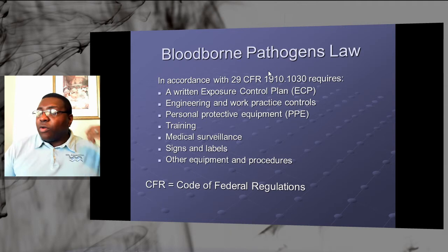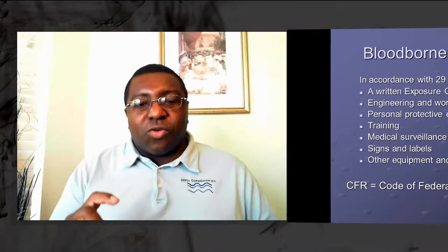And in wastewater and water treatment, you deal with ampules a lot. The ampules are what you're using to get your reagent to mix with your sample. Once those ampules are done and you're finished with your lab test, you would have had to break off the tip of the ampule in order for the vacuum system to work to suck up the sample into the ampule for contact with the reagent.